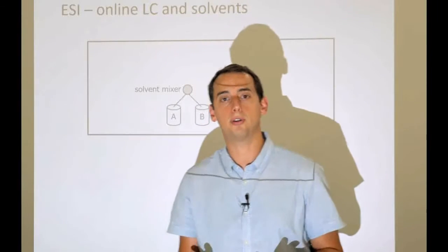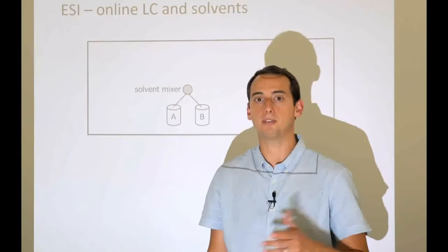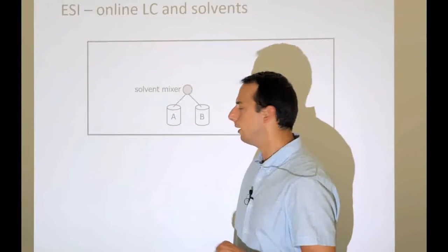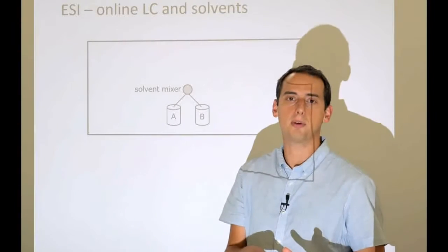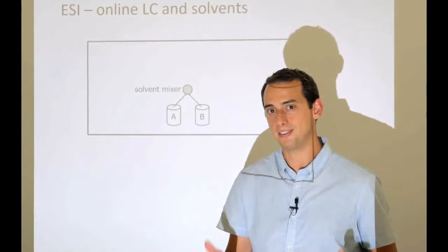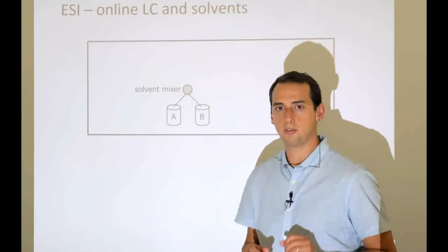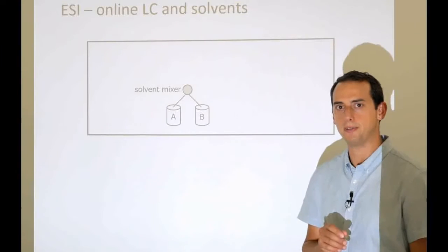That's not counting any modifications that might occur on the peptides, such as shortening them or adding chemical groups to them like phosphate or whatever. Now, this is an enormous amount of peptides, and if you throw this at once at the mass spectrometer, it's simply going to be overwhelmed. So we try to separate them out in time. And for that, we use a clever trick depending on the hydrophobicity of the peptides.